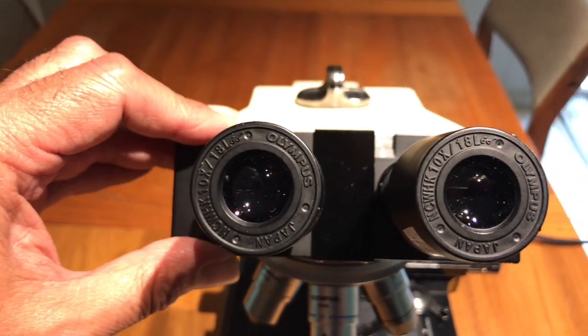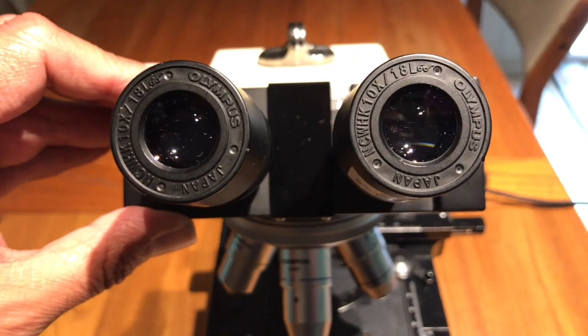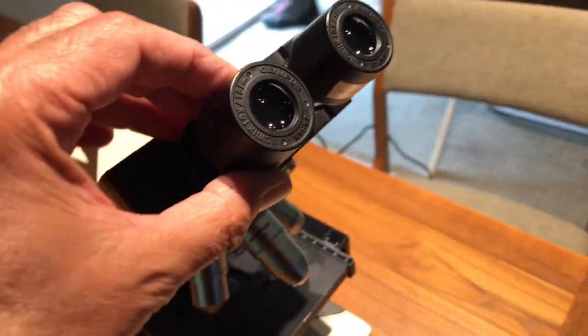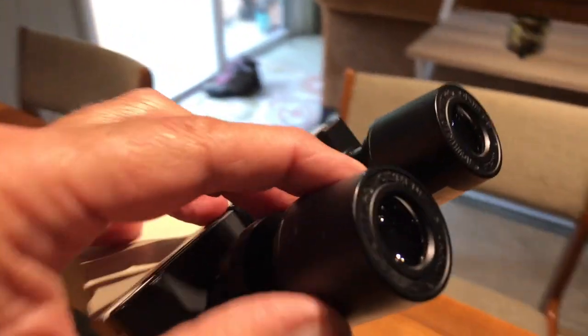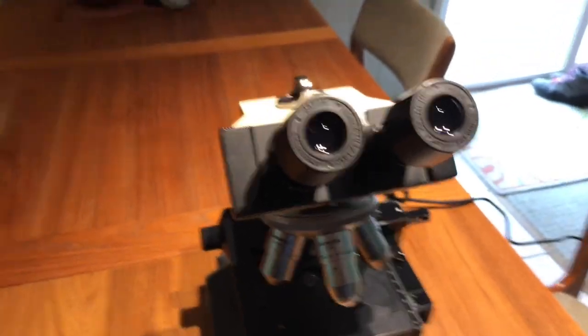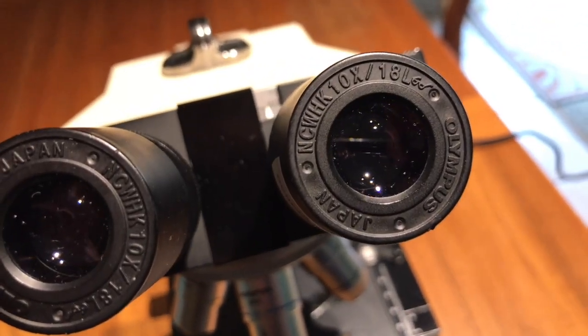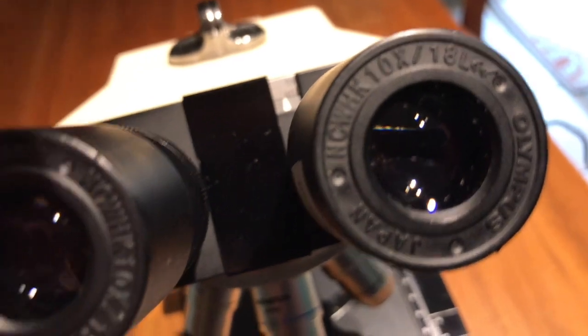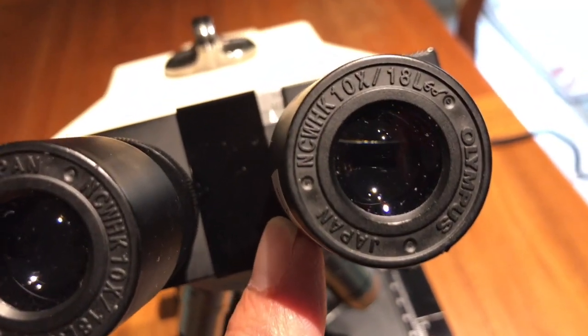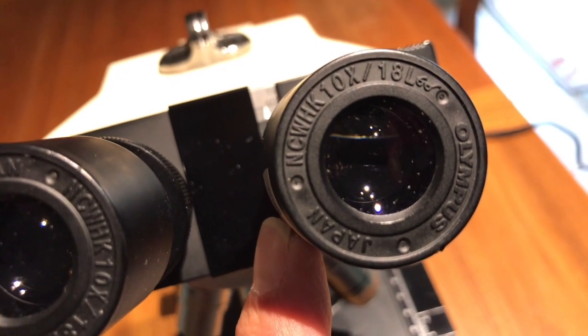All of the lenses should have... well these ones, that's interesting. So usually most of the lenses will tell you. Oh yes, they do. Yes, okay, so all of the lenses are marked with their magnification. In this case we can see that the eyepieces themselves have a magnification of 10x.